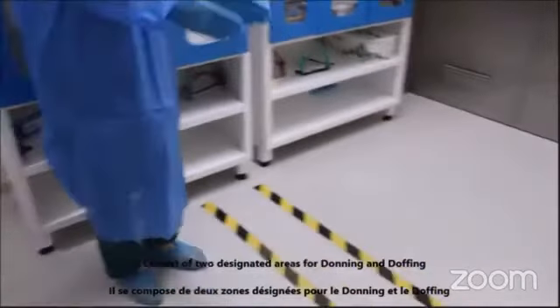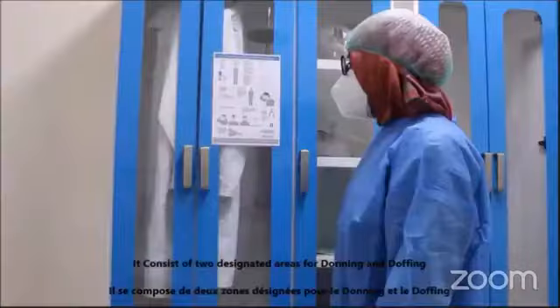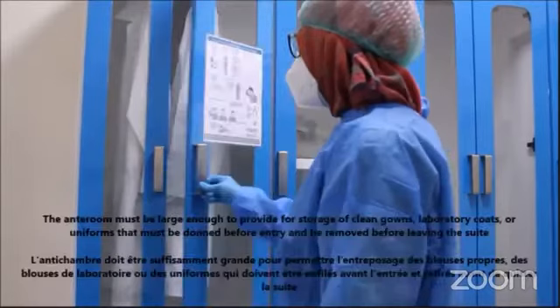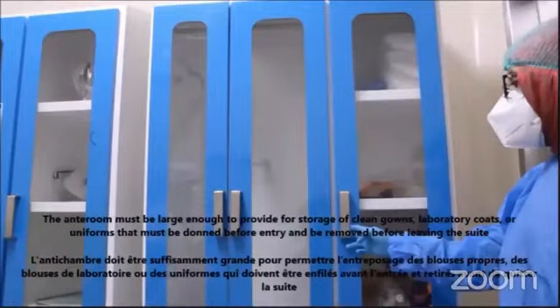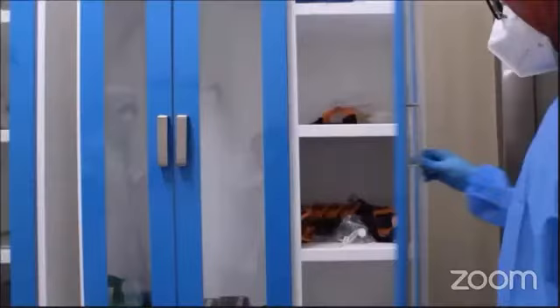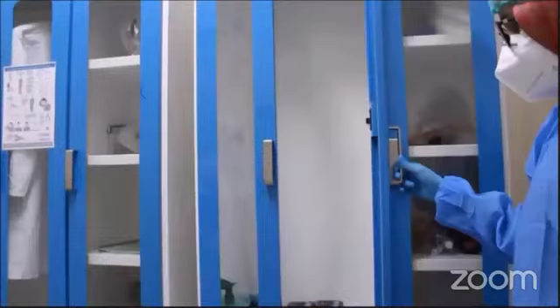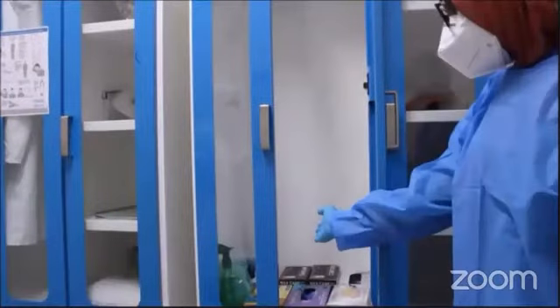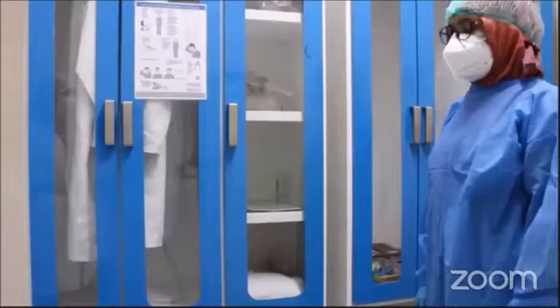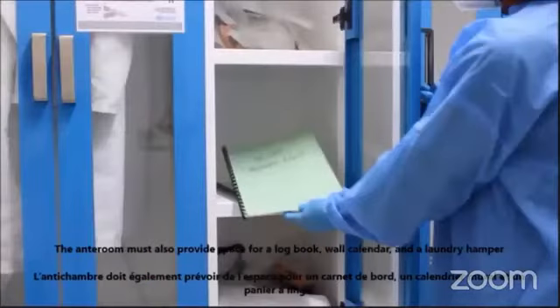It consists of two designated areas separately for donning and doffing. The anteroom must be large enough to provide for storage of clean gowns, lab coats, or uniform that must be donned before entry and removed before leaving the suite. The anteroom must also provide the space for a logbook.